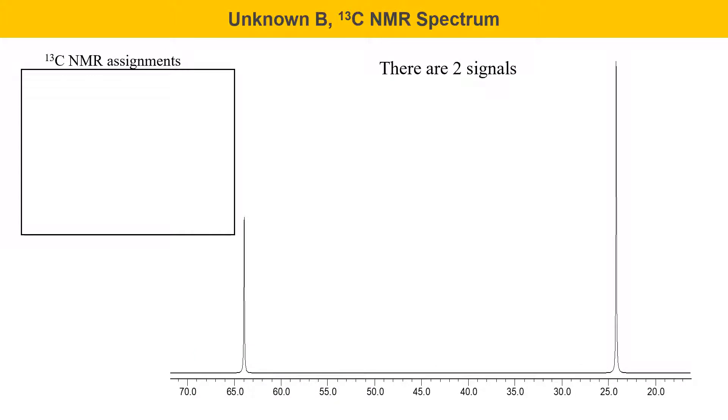The carbon-13 NMR spectrum for unknown B is shown here. There are only 2 signals. Now, this is interesting because this molecule, I will tell you, has 3 carbons. The reason there's only 2 signals is that there's some symmetry in this molecule, and that some of the carbons are the same. There's an internal mirror plane of symmetry in this molecule that makes 2 of the carbons the same. That's something to watch for in some of these spectra. Unknowns B through H contain a few high symmetry molecules that have some nuclei that are the same and give the same signal.